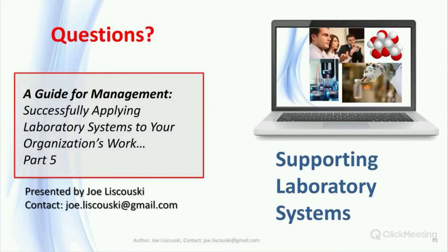The problem is going from the symptom to the solution, and to what the real problem is, and that requires understanding the process, the equipment, what contributing issues there are, and the trial and error of problem solving. Frequently you find that IT people will say, well, we can understand the hardware, we can understand the software, but there's other stuff out there and we have no clues what that is. And sometimes instrument vendors will be very good at managing their instruments, but when it comes to the computer systems, they're not on top of all that stuff.